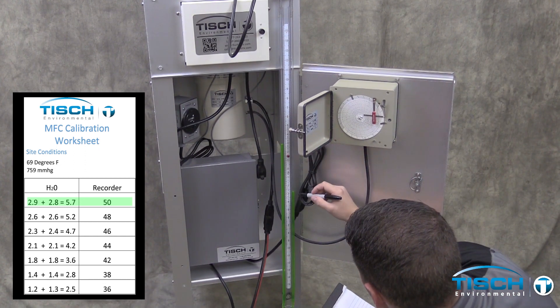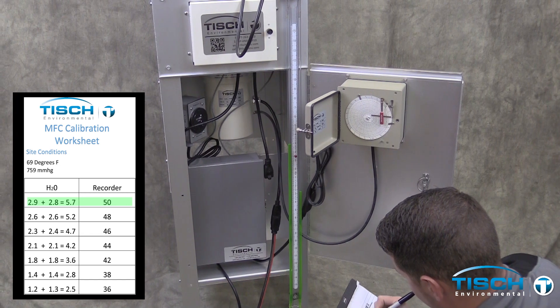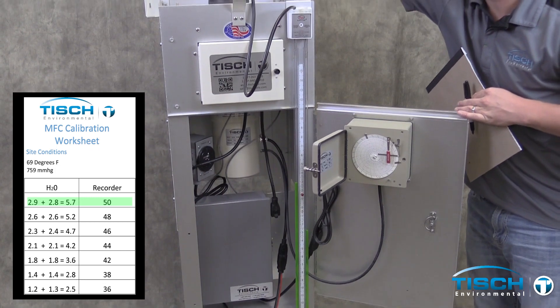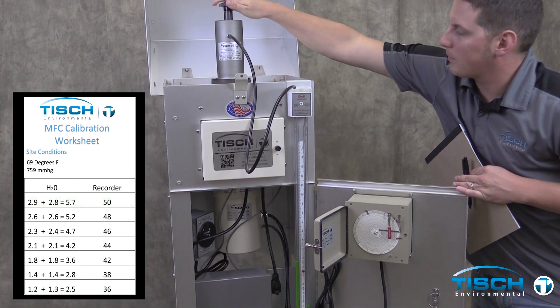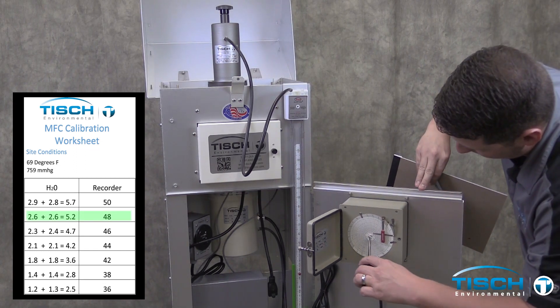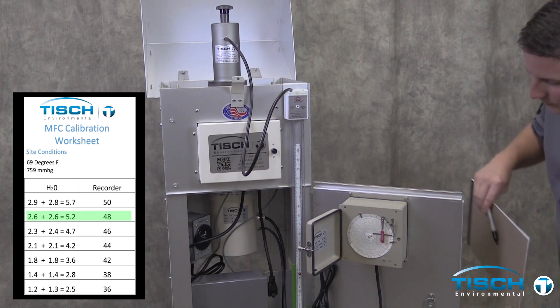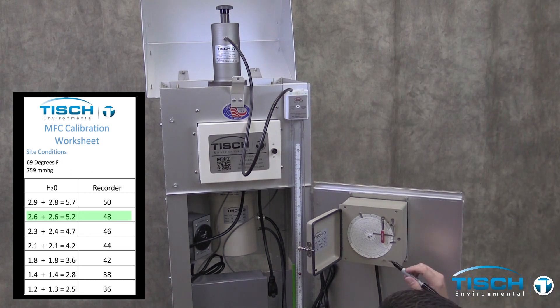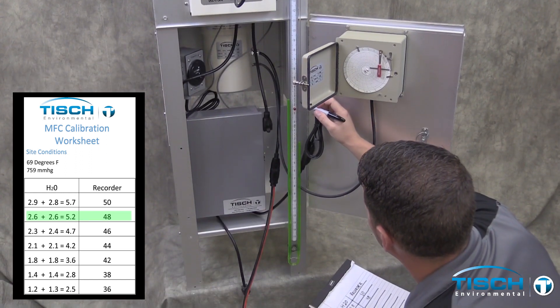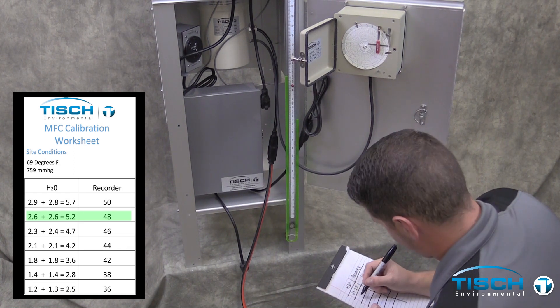Then read the manometer. One side goes up and one side goes down. In our example, it went up 2.9 and it went down 2.8 for a total of 5.7. Turn the knob clockwise this time to get to a reading of about 48 on the chart. In our example, we got 48 on the chart and the manometer went 2.6 up and 2.6 down for a total of 5.2.